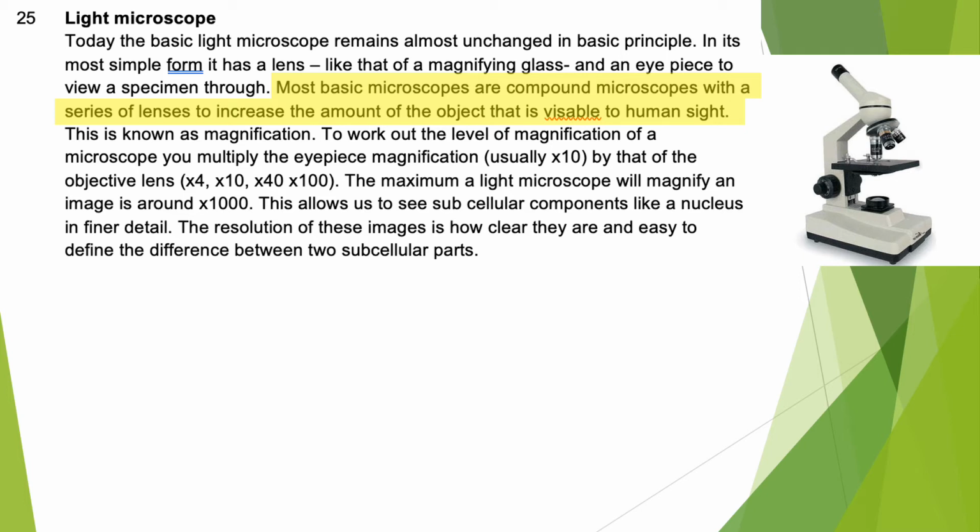All right. So that definition right there is actually called magnification. When you magnify something, what you're essentially doing is blowing up the image to a proportion or a size that you can actually see very, very small details in. All right. So it doesn't stop right there, though.